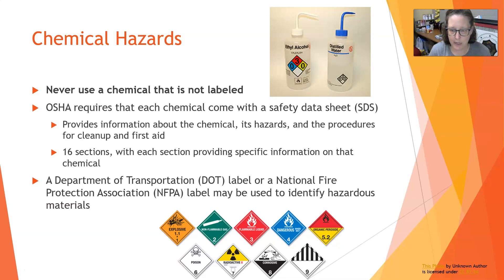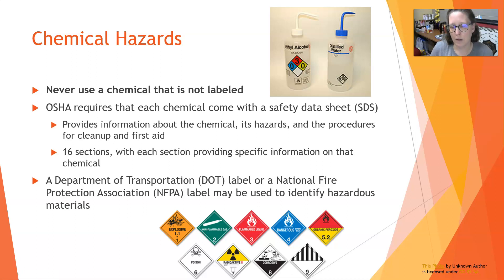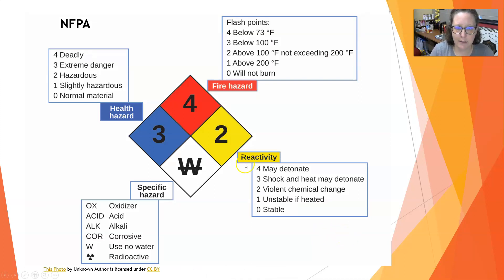The DOT labels are the ones you see on trucks and train cars when driving on the road — to warn anyone nearby whether the contents are flammable, radioactive, explosive, or otherwise dangerous. The NFPA labels look like a diamond divided into four colored sections: blue for health hazard, red for fire, yellow for reactivity, and white for specific hazards.